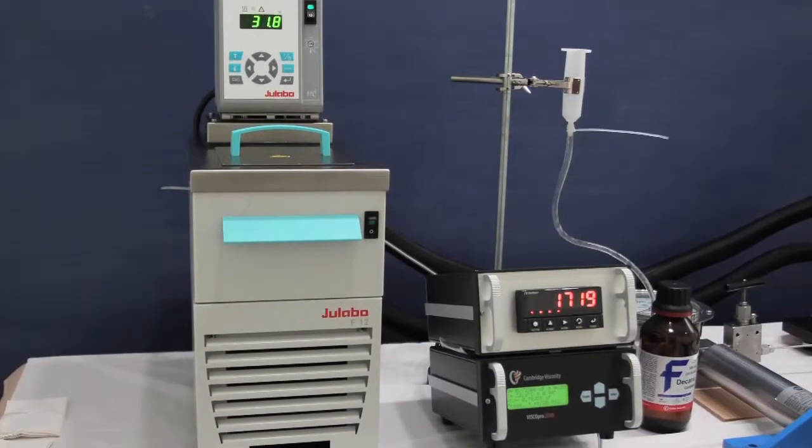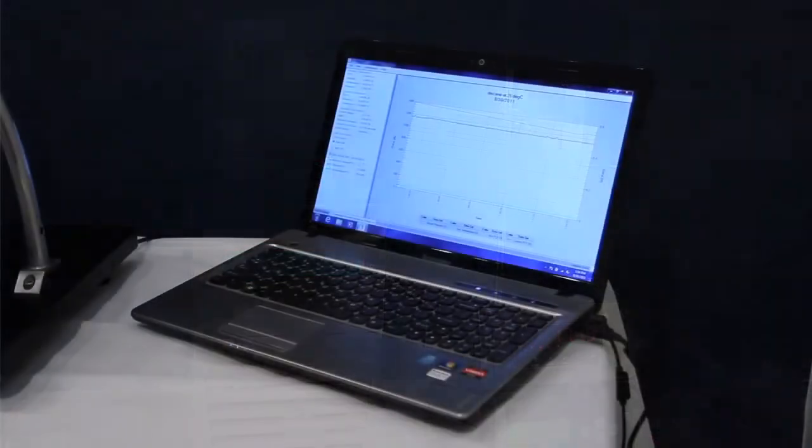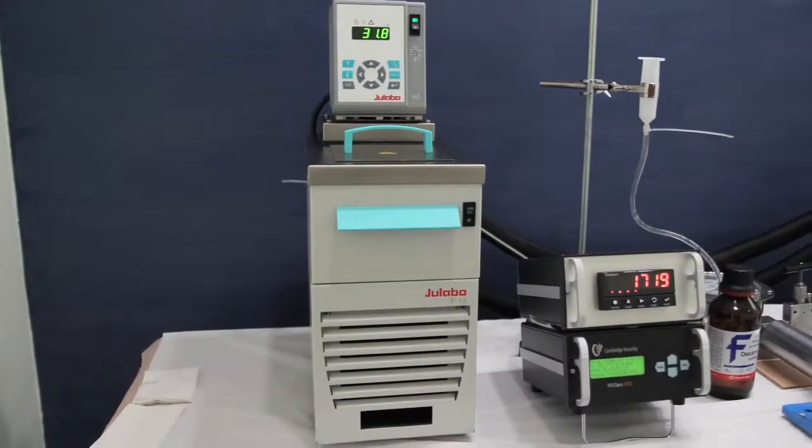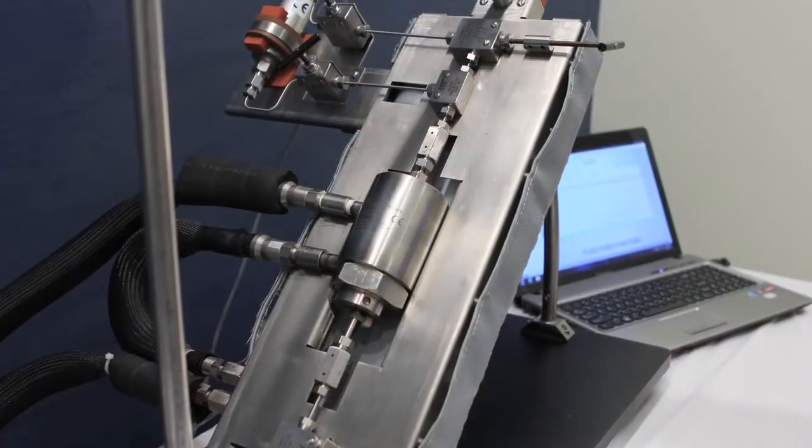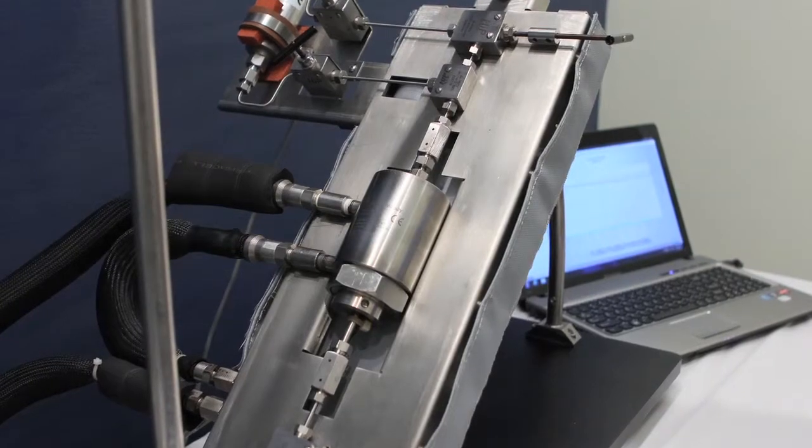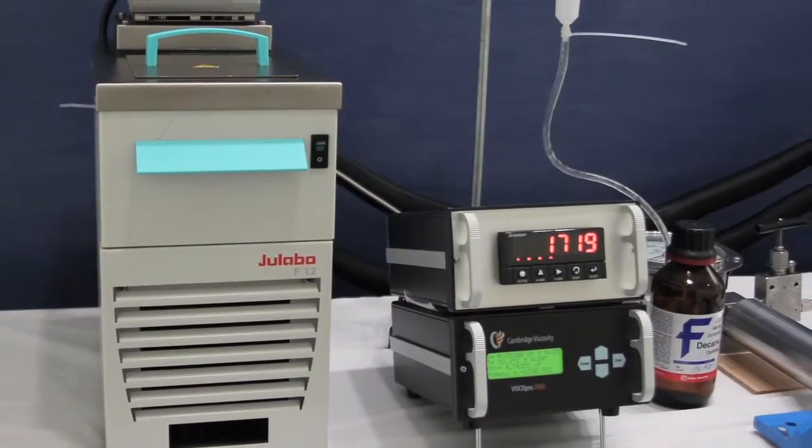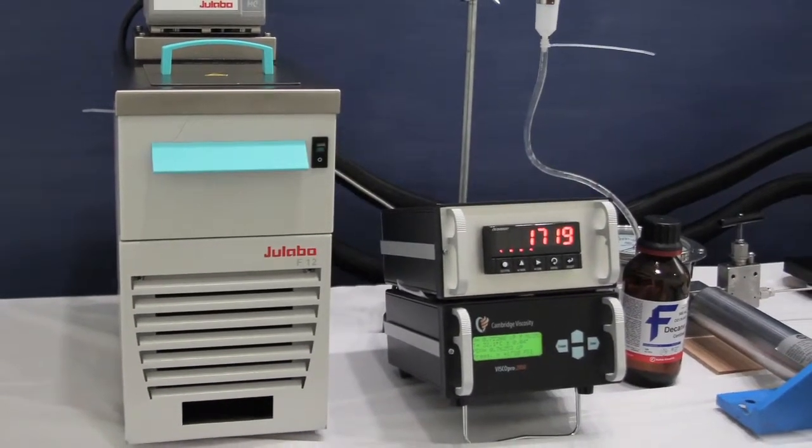Recirculating bath for temperature control. User interface data acquisition system. Standard ViscoLab PVT can reach up to 190 degrees Celsius with pressure reaching 20,000 PSI. There are additional options to reach 315 degrees Celsius and 40,000 PSI.